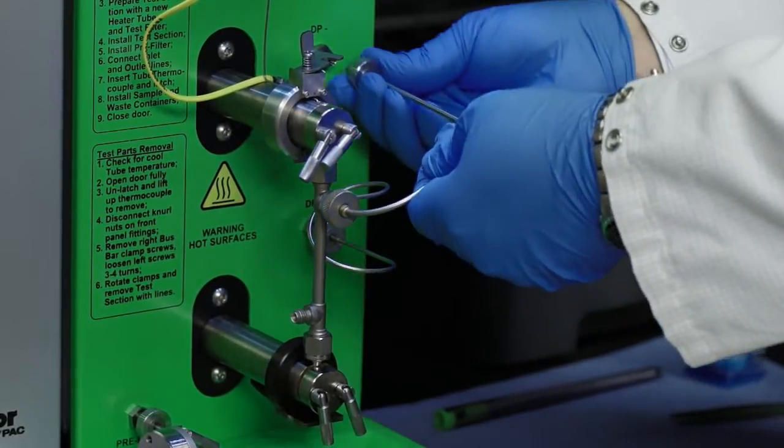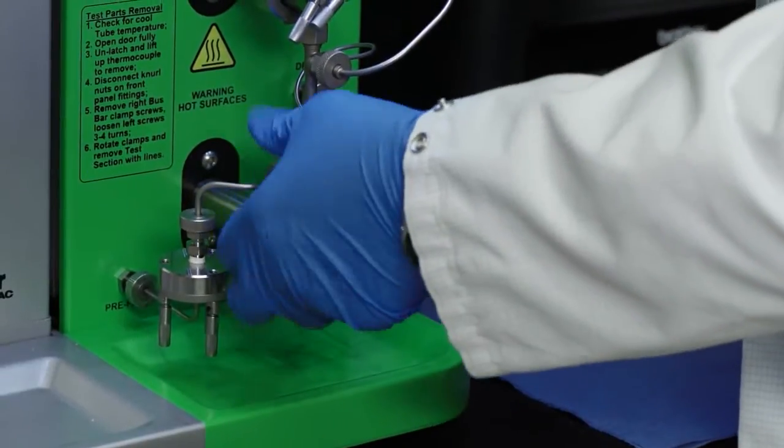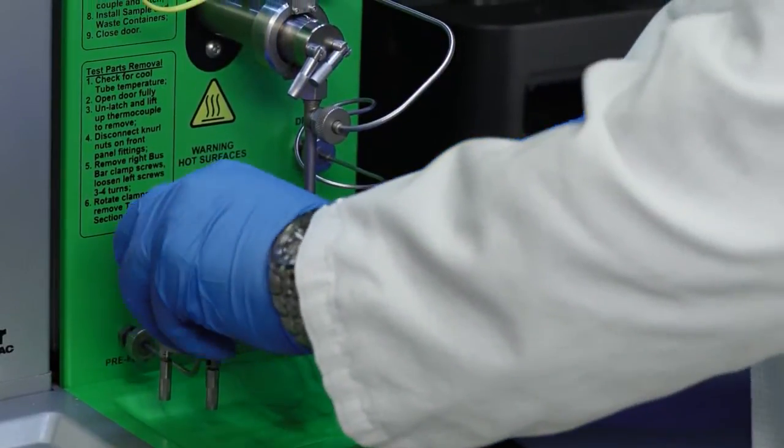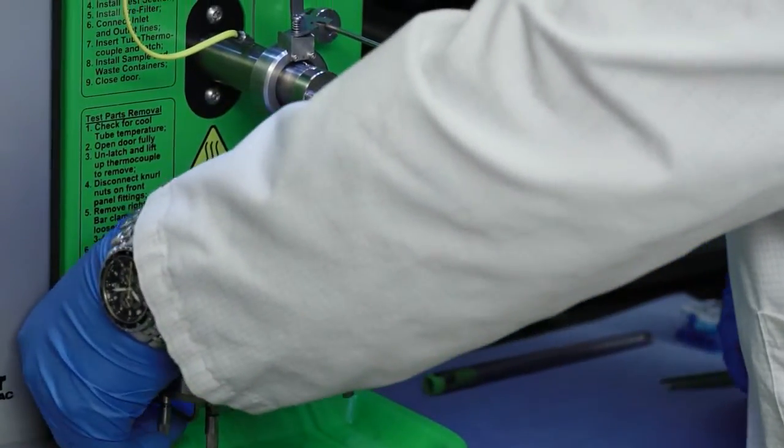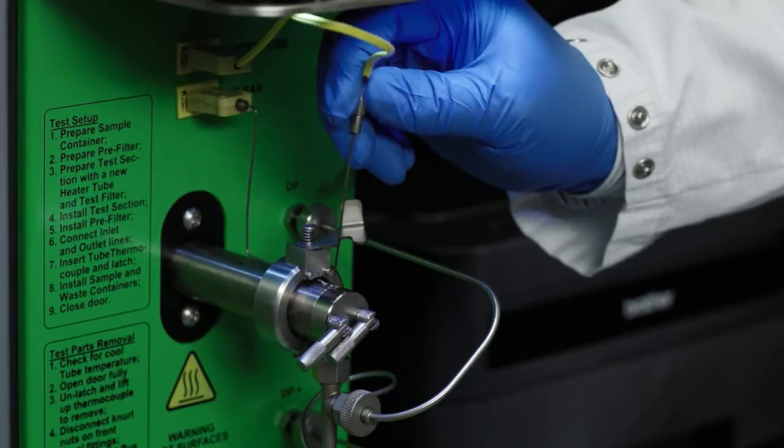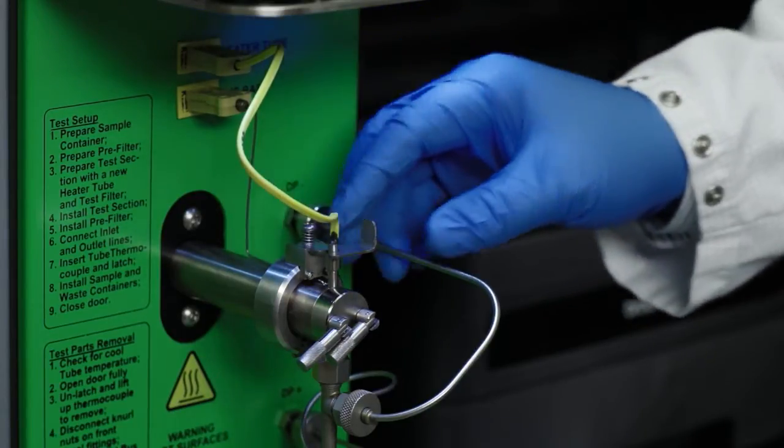Now install the prefilter assembly. Then, install the inlet line between the prefilter assembly and the test section, and connect the test section outlet lines. Insert the heater tube thermocouple completely into the hole in the top of the heater tube, and slide the holder over to hold the thermocouple in place.